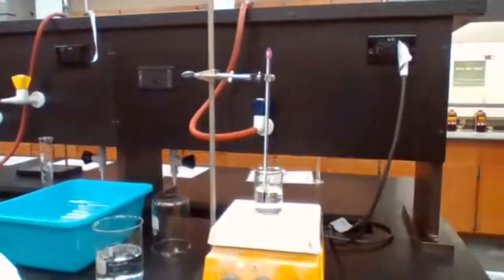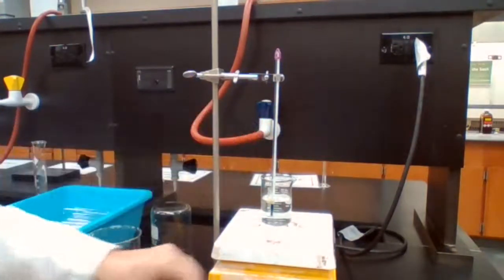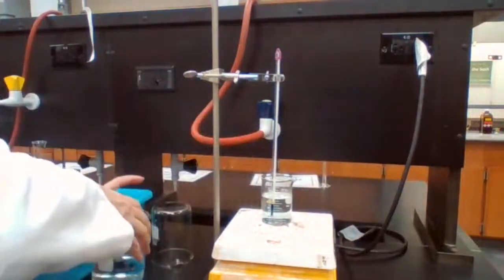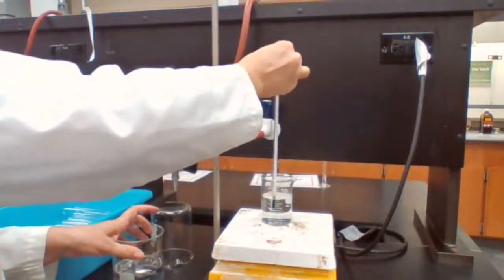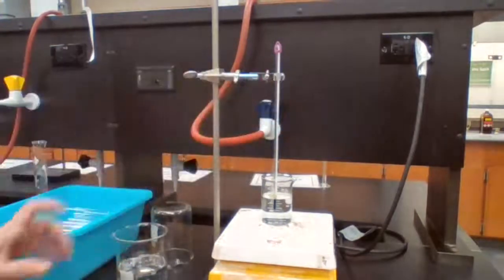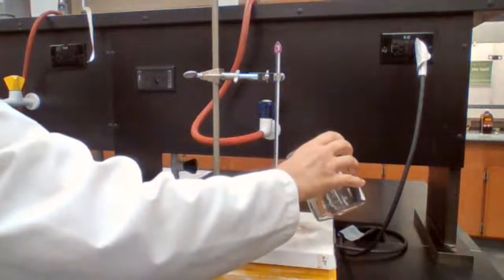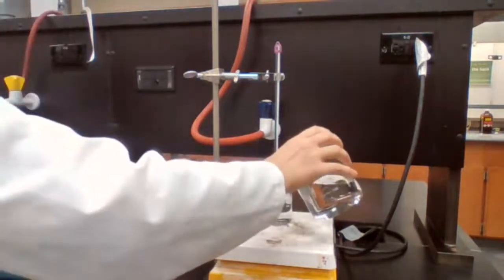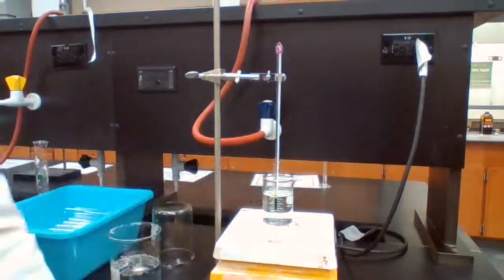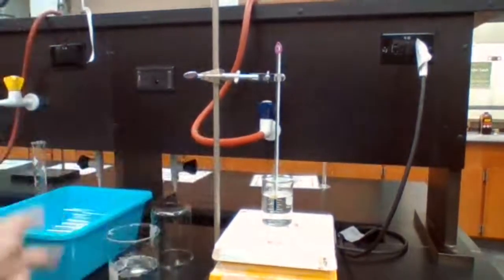Okay, now all we have to do is wait and look for the bubbles coming out. If the temperature is high, it might happen quickly, so I'm going to make sure it's not too high. The temperature of the water before you put in your sample must be lower than the boiling point of your unknown. Otherwise, as soon as you place it, it's going to start boiling.